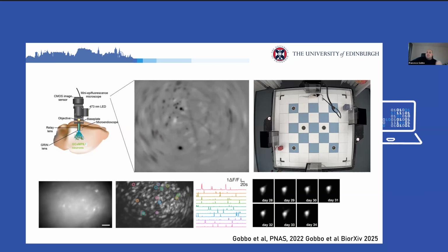So this is the typical recording that we obtain when animals, and in particular rats, are moving around. Rats are free to move in a very wide environment. The arena that we're using is larger than 2 meters. So they have the possibility to explore this environment, retrieve food pellets at different locations, and then essentially test them for their memory. And at the same time, we can record what happens in their hippocampus by looking at these flashes of neurons in CA1.